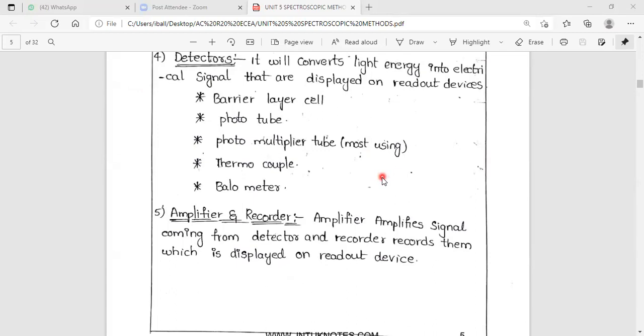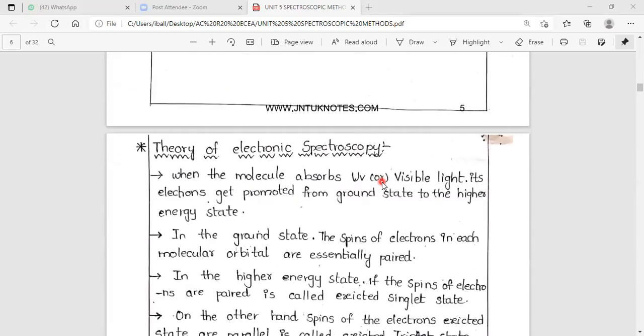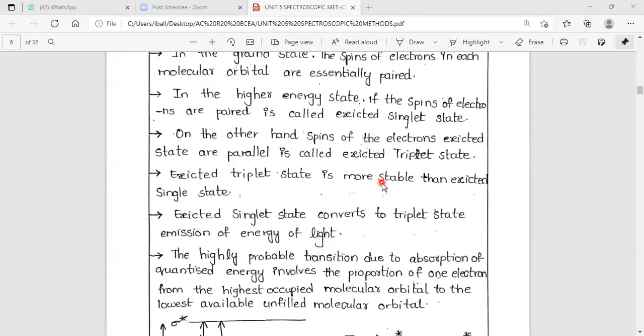Number 1. And number 2, we discussed the instrumentation. Ultraviolet spectroscopy instrumentation contains a double beam radiation focused on the sample, which absorbs some amount of radiation, and the rest is transferred to the detector. The detector transfers the energy to the recorder containing the data.